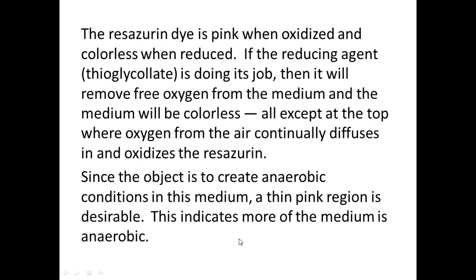Right, so resazurin is that dye that is pink when it's oxidized, and it's colorless when it's reduced, right? So it's all throughout the media, but it's not producing a color towards the bottom of our tube. So hopefully we just see it at the top, right? The whole purpose of using this media is to create an anaerobic environment in the bottom of that tube.